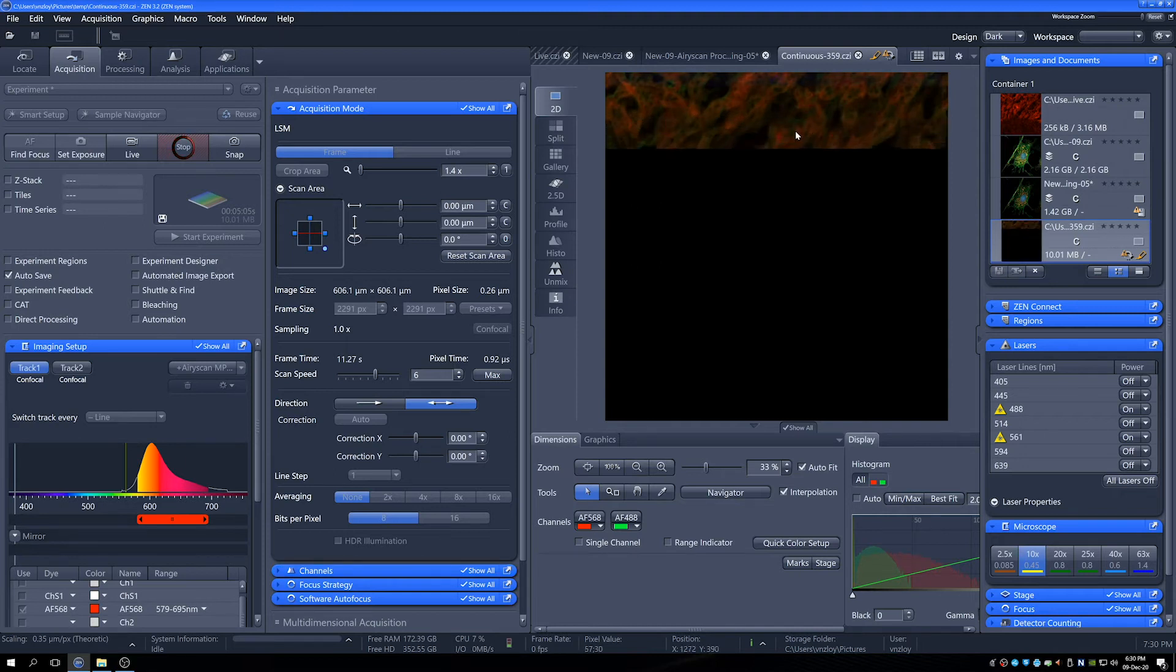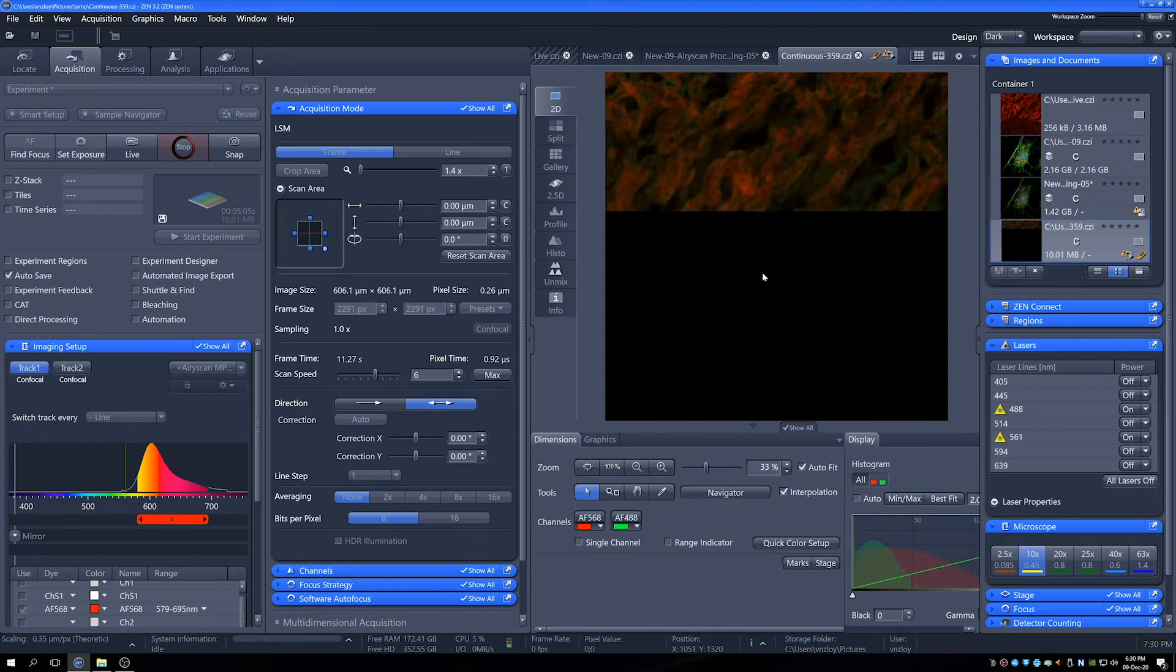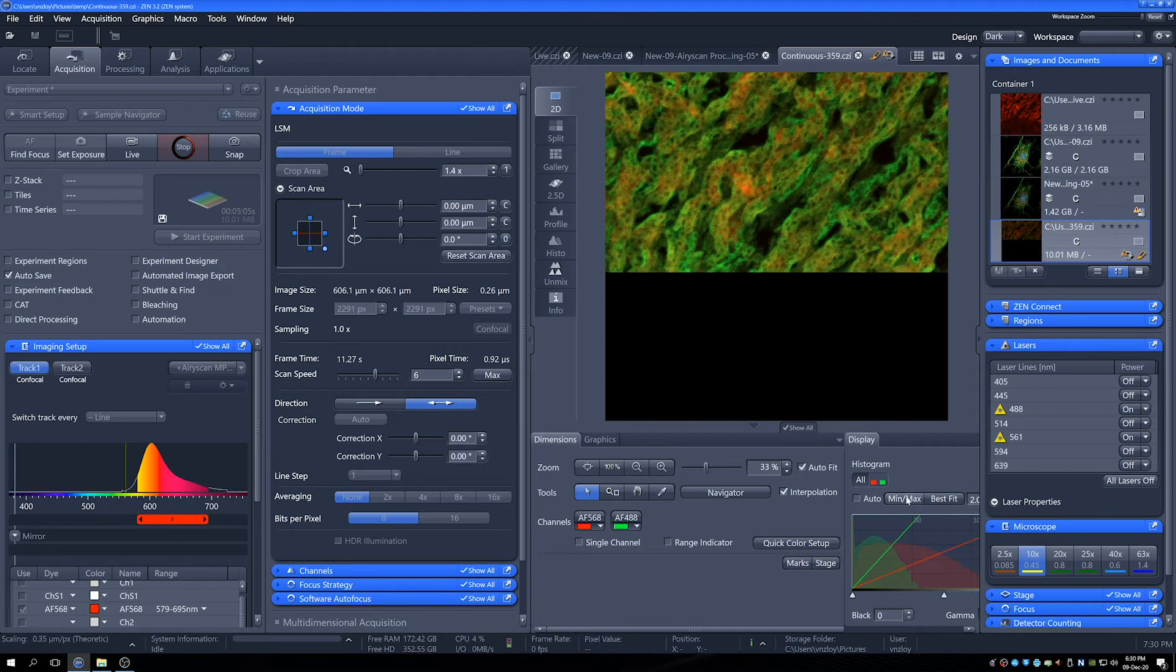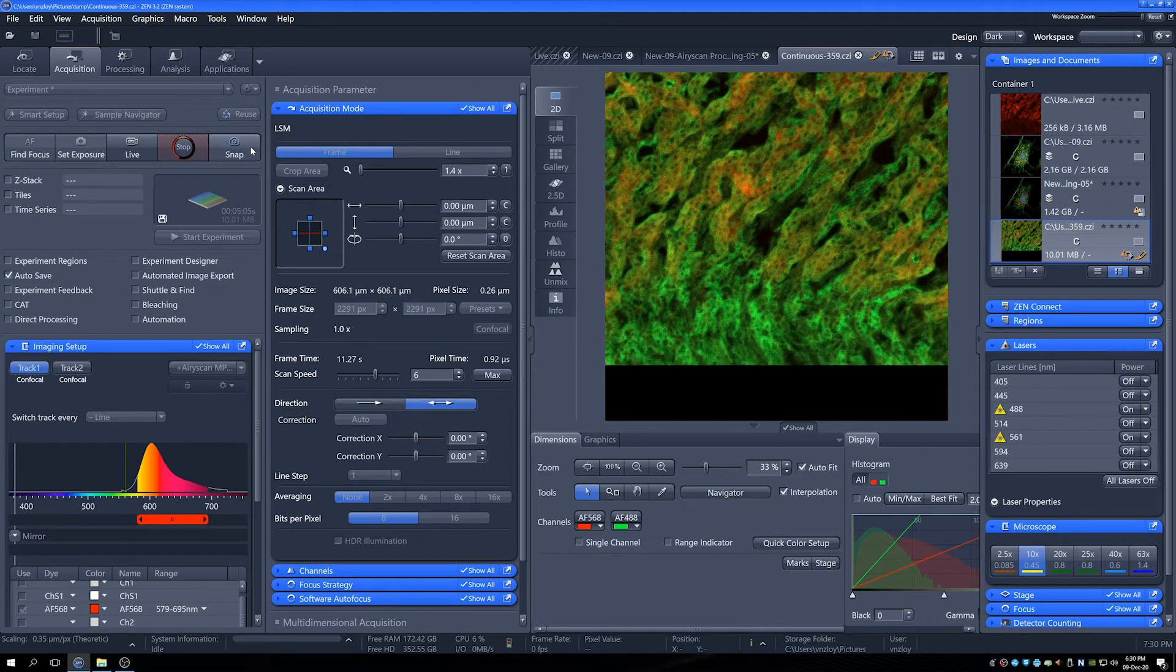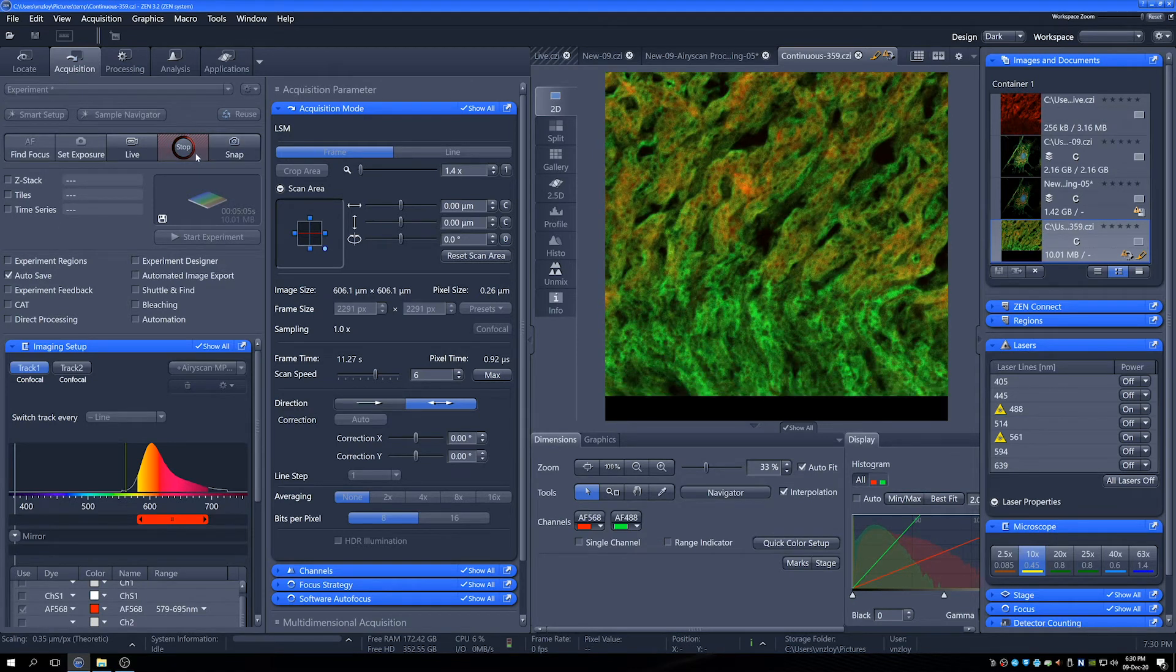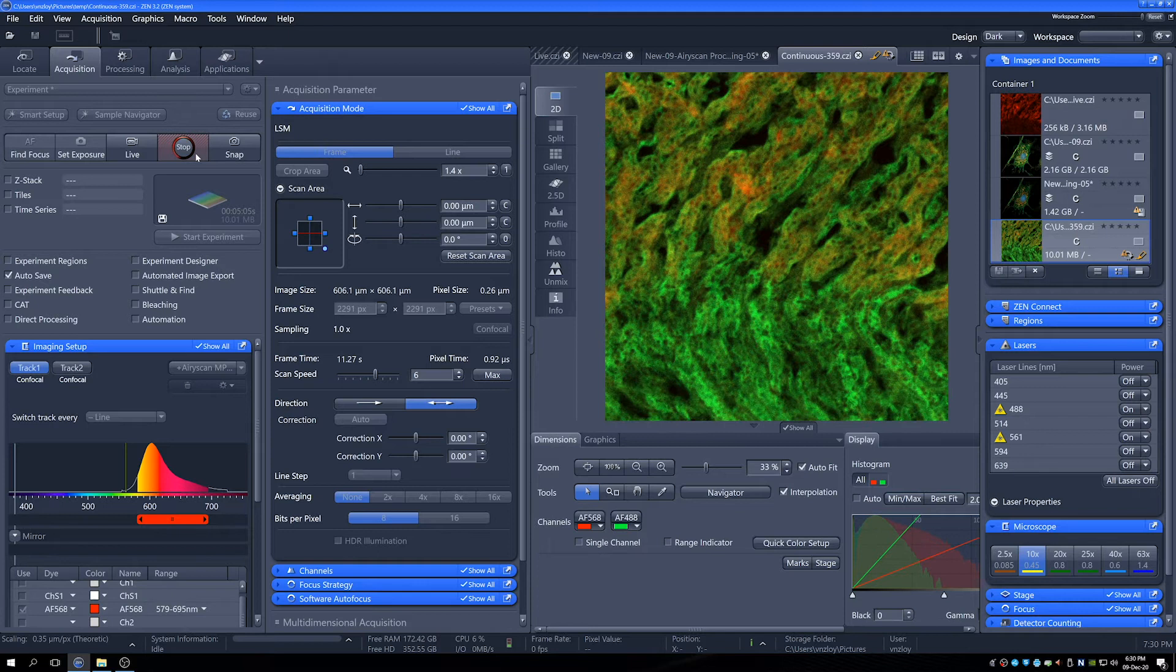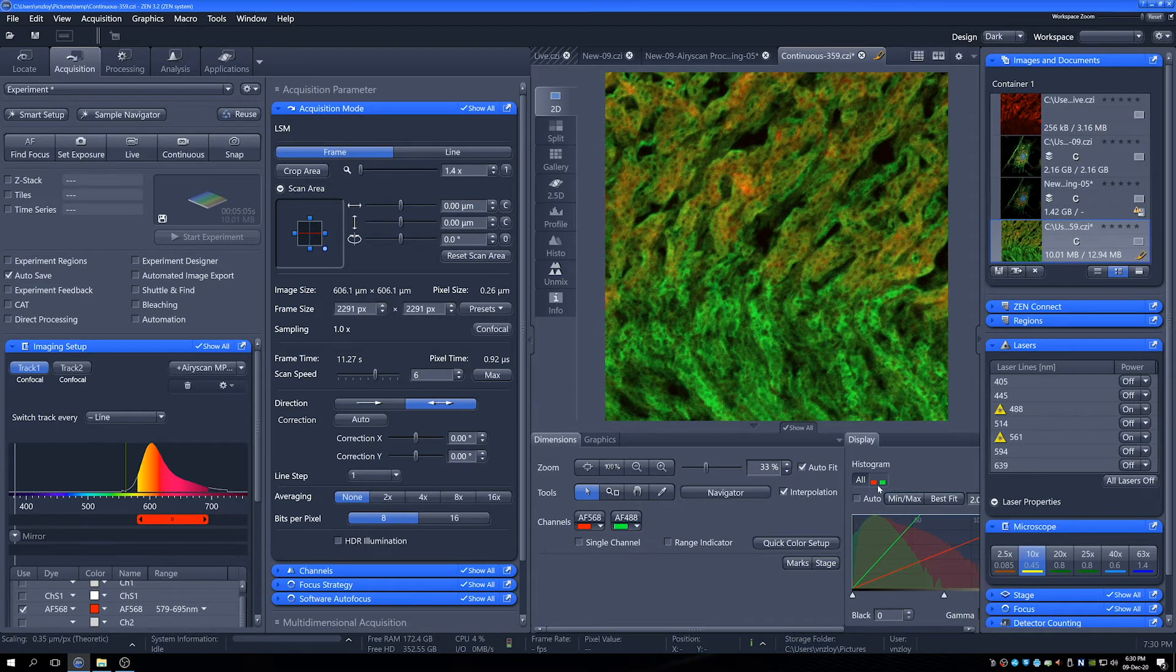Here we can see the scanning is much slower, but now the image looks much nicer. If we just min max that, so we get a decent idea of what it's done. So once it's got to the bottom, we can stop that and we can have a little look.